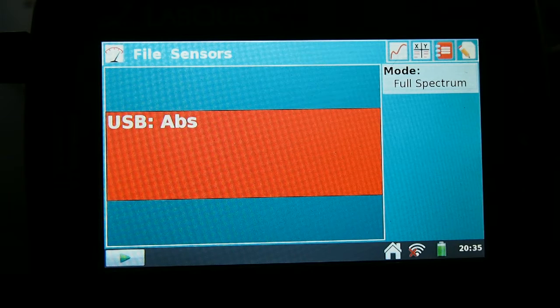This is illustrating the interface of the LiveQuest app. As you can see, it's on full spectrum mode. We're going to set up the calibration system, but first we have to remember that this is working on full spectrum right now.